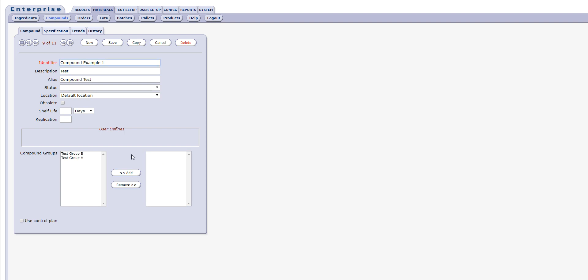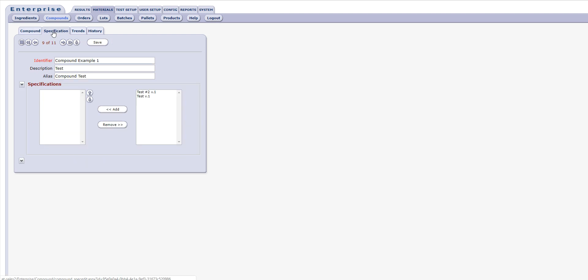The Specifications tab allows the user to link a specification to the compound as well as set the order of specifications if applicable.